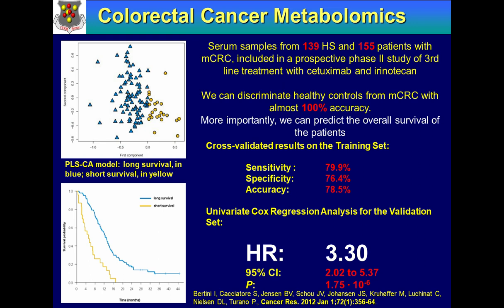We looked at people with metastatic colorectal cancer after third-line treatment, so people in, say, very bad shape, unfortunately. And here the accuracy of recognition of diseased people versus healthy subjects is 100% because the disease is really well advanced, and in the end, ultimately, all of these people died by metastasis.